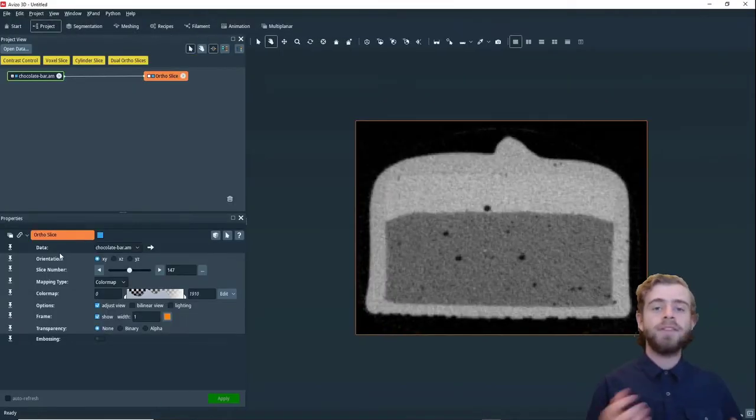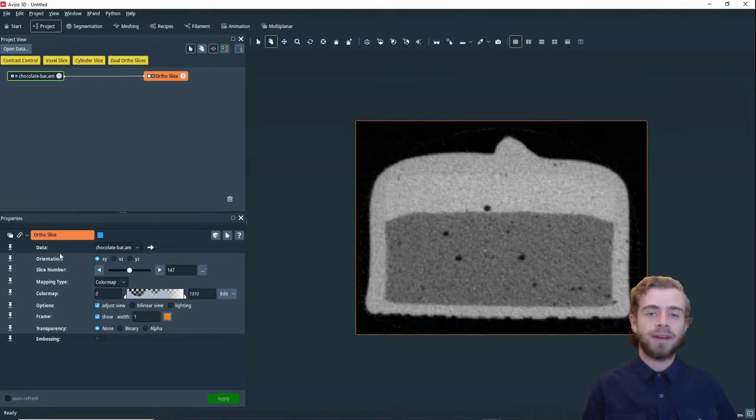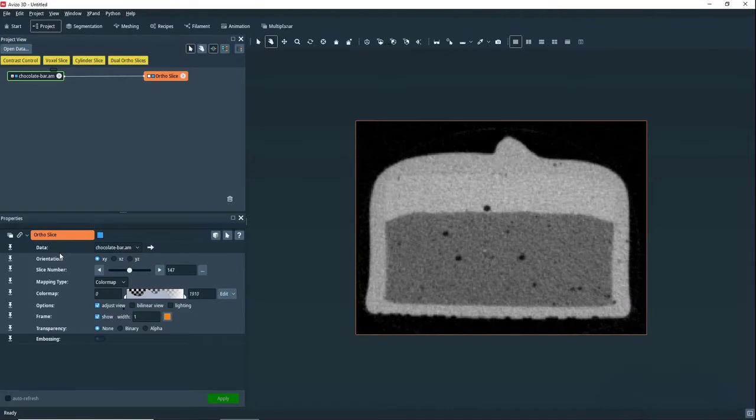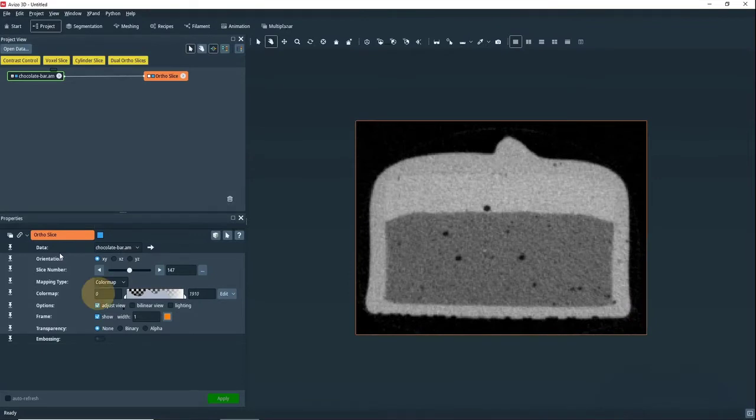So Avizo automatically creates an ortho slice for us and applies a grayscale color map to it. This data set is what you call a scalar image. It just has a single intensity channel going from 0 to 1,910.